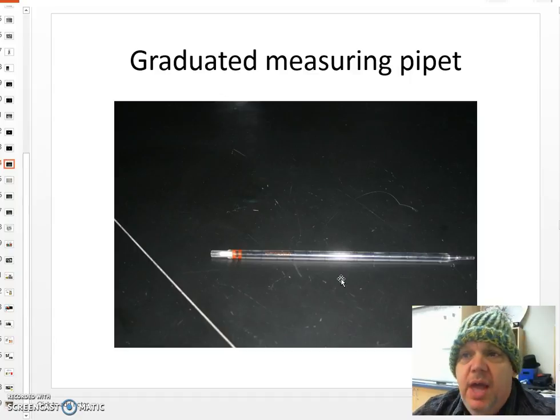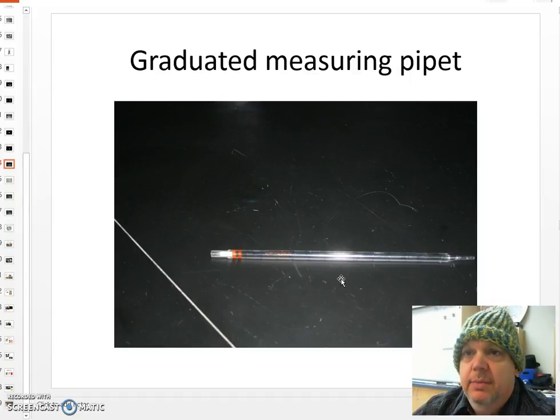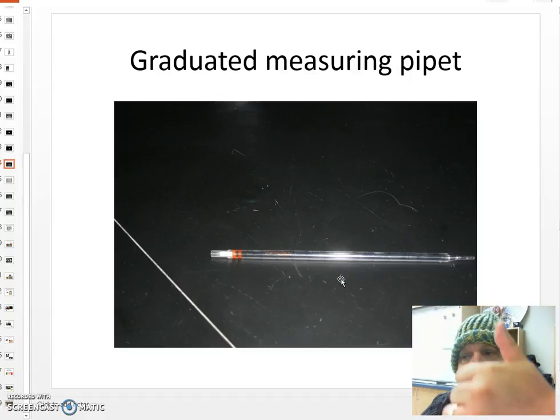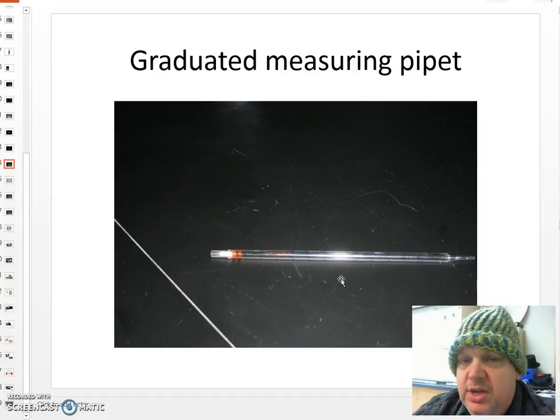We last left off at the graduated measuring pipette, which again, you're measuring specific amounts of liquids, depending. The word graduated means that there are line markings that tell us the measurements. We can use different types of suction in the pipette to be able to pull the water out. Sometimes it could be a bulb, similar to what you have at the doctor's office when they check your blood pressure. Or it could be a device that has a little thumb wheel, and as you're thumbing the wheel, the device helps suck up whatever liquid it is you are trying to get at.